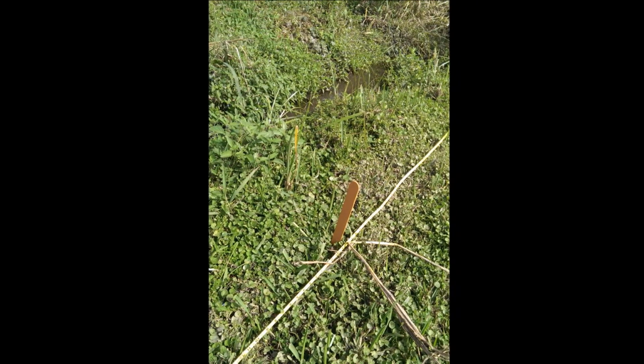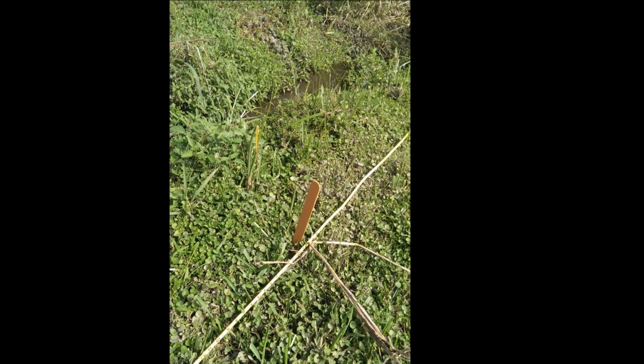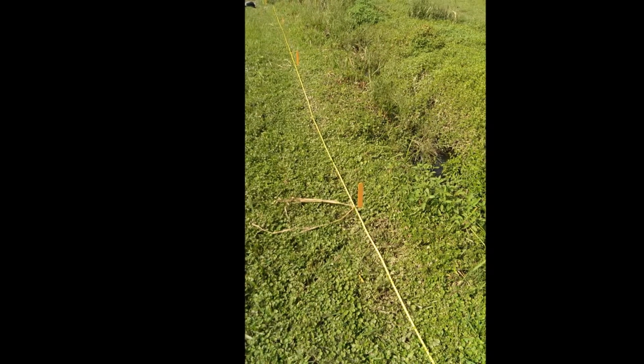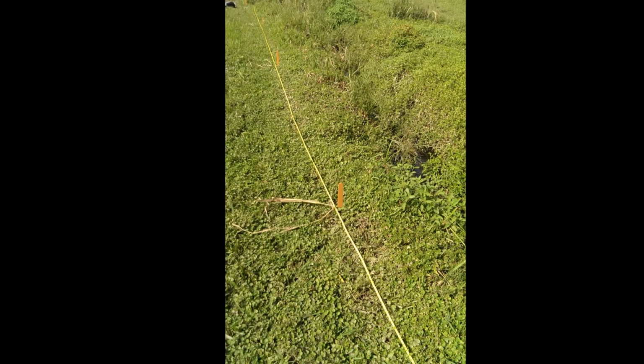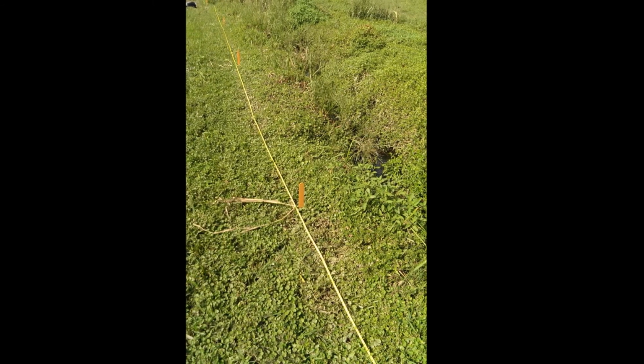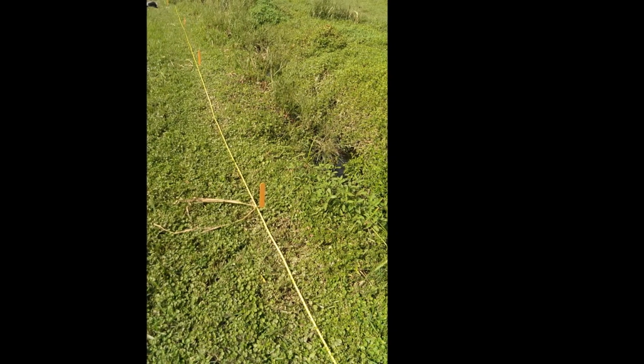Remember, samples must be taken within 30 minutes of a rainfall event, and samples must be representative of the source. Next, use stakes, measuring tape, and twine to mark all sampling locations. Systematic random sampling was used during this procedure, but sampling techniques may vary.